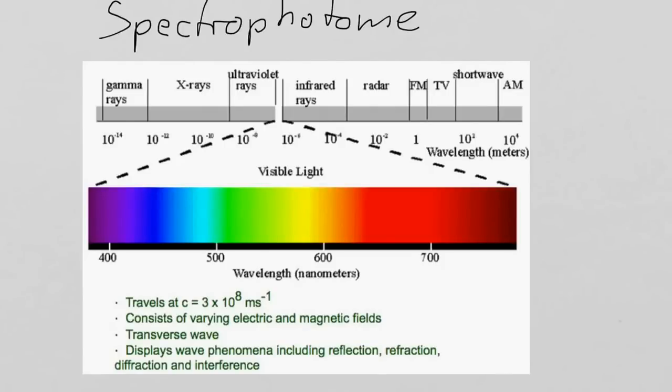So here is a picture of the electromagnetic spectrum, and it contains visible light. So that's basically, no, that's the wrong one, sorry. I want this one. So that's basically what we can see, or the light, the electromagnetic waves that we can actually observe by eye.